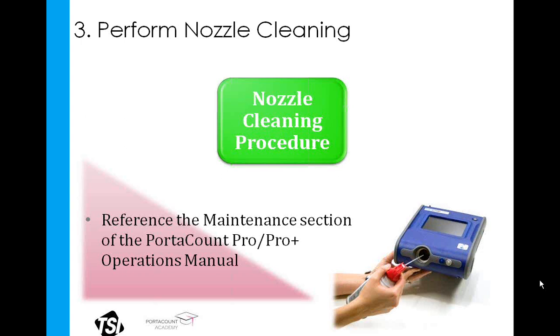The idea behind this procedure is to wet the particles with a small drop of alcohol and then blow them through the nozzle that is located at the back of the alcohol cartridge cavity with a can of compressed air, as shown here. This is actually a recommended maintenance procedure, though we have no recommended time interval.